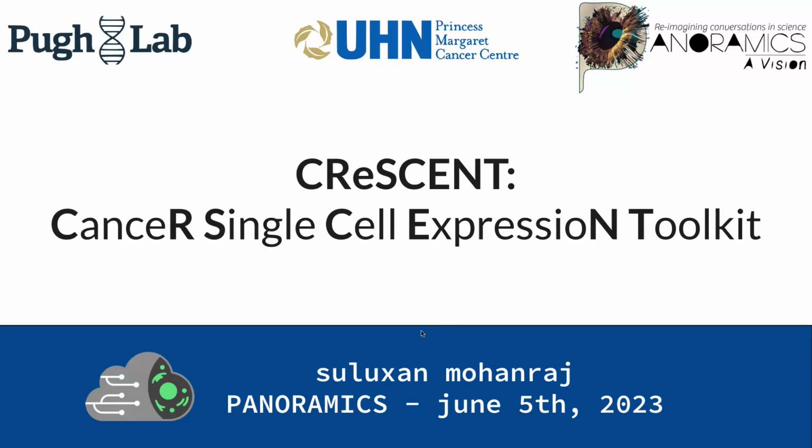Okay, so hello to in person and hello to online. I'm going to be talking about this tool called Crescent, mainly going to cover single cell RNA sequencing and analysis, how to get data into the system. Crescent is essentially an acronym, as all scientists love acronyms: Cancer Single Cell Expression Toolkit.